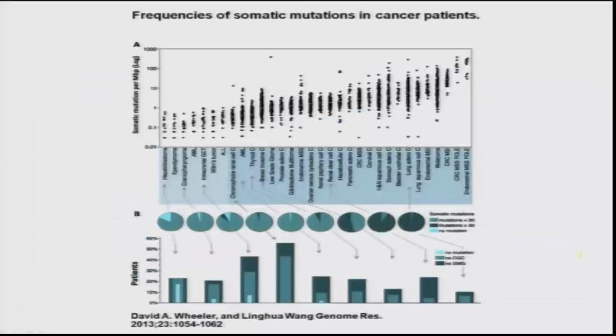There are segments in the genome which undergo multiple copy number variation. They get amplified in cancer. The number of copies goes up. Unlike Sanger sequencing, where you are cloning and sequencing, which does not tell you about the quantity or the quantitative measurement, next generation sequencing tells you how many reads, how many molecules you are able to read. It also tells you the copy number variation. That is a huge advantage of next generation sequencing.